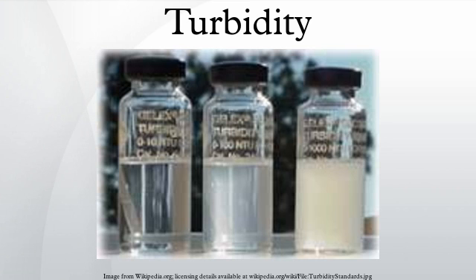The alternatively used Jackson candle method is essentially the inverse measure of the length of a column of water needed to completely obscure a candle flame viewed through it. The more water needed, the clearer the water. Of course, water alone produces some attenuation, and any substances dissolved in the water that produce color can attenuate some wavelengths. Modern instruments do not use candles, but this approach of attenuation of a light beam through a column of water should be calibrated and reported in JTUs.